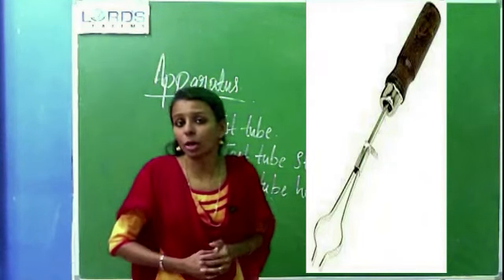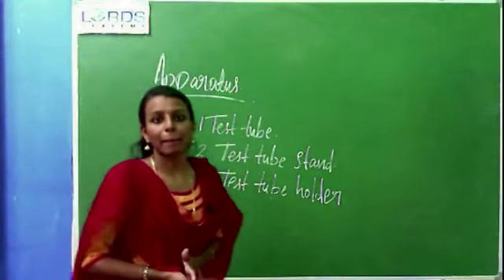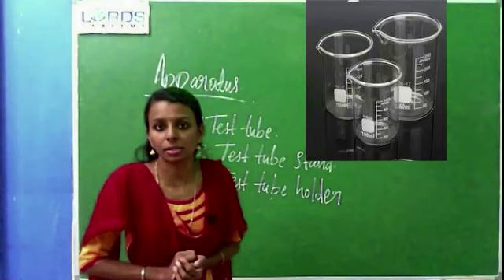What is the use of test tube holder? We can hold the test tube while heated up. The next apparatus, just look at the picture. This is our next apparatus.